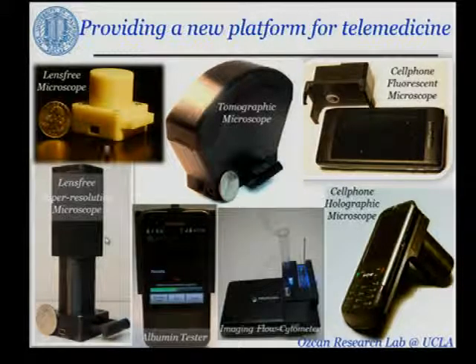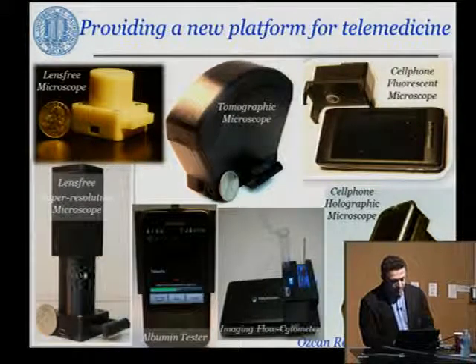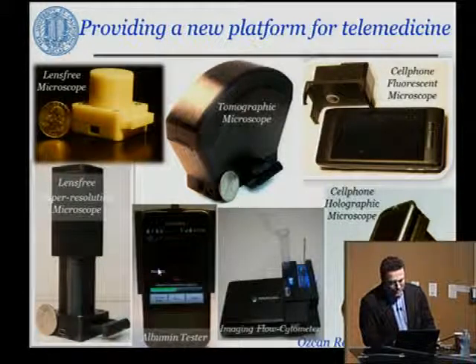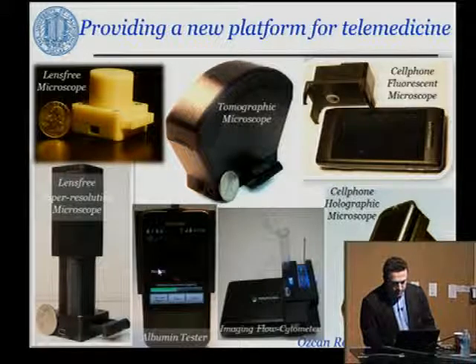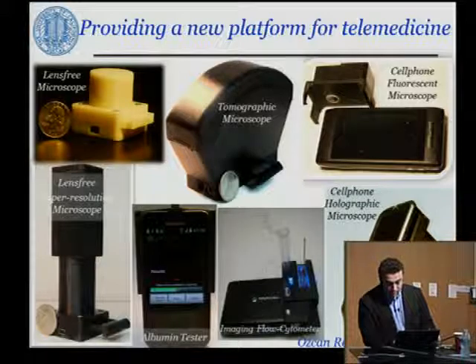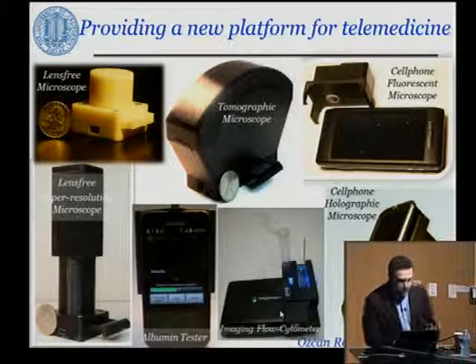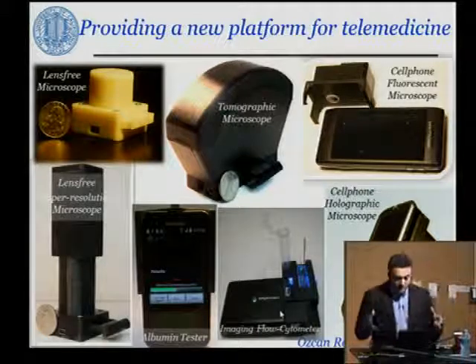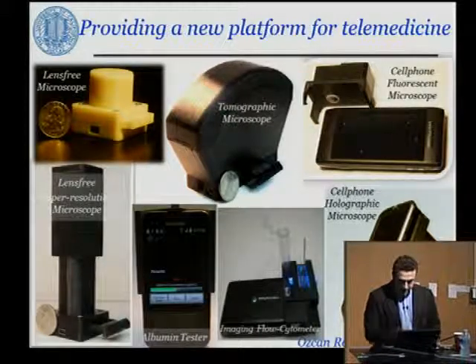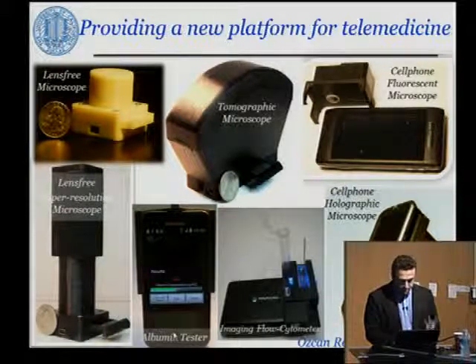I'll explain the underlying technology behind this, but just to highlight upfront, it's not just a cell phone. Sometimes it's the CMOS imager that is borrowed from a mobile phone. In addition to microscopic imaging in fluorescence or in bright field mode, you can also convert the mobile phone into a sensor. In this case, you're looking at an imaging flow cytometer, which flushes through a disposable microfluidic device some cell lines, let's say in this case blood, and then can look at a movie and process it for looking at counts of cells per unit volume.